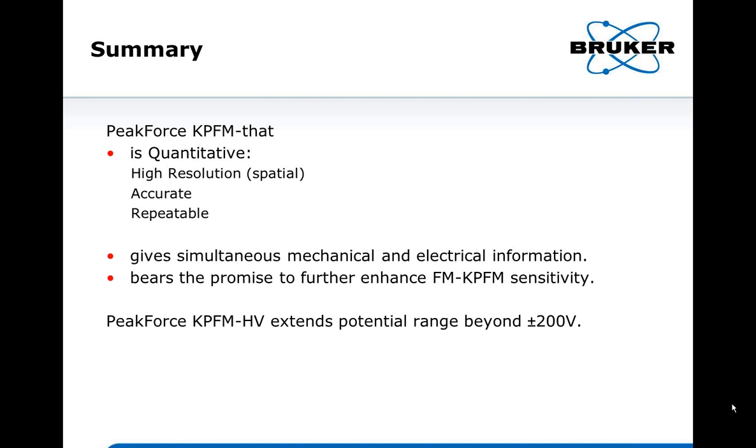On the polystyrene beads in that image, it was observed there is a potential variation, I think, within the bead area. Do you think that's real, or is there a question of topography convolution in the KPFM signal there? I'm not exactly sure which part you're talking about, but I believe in the polystyrene part there may be some LPD or some contaminants there. I think it's true. It's real there.